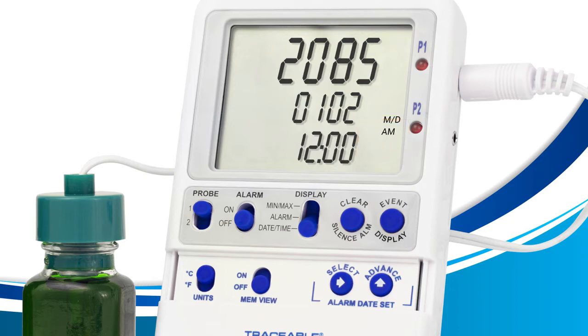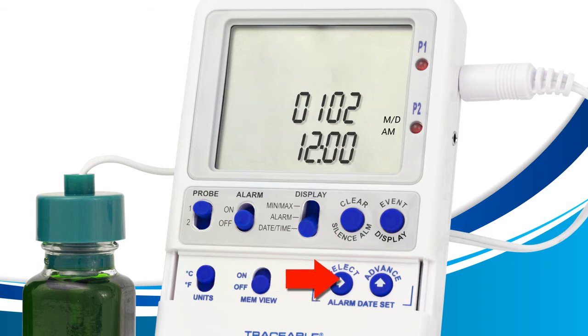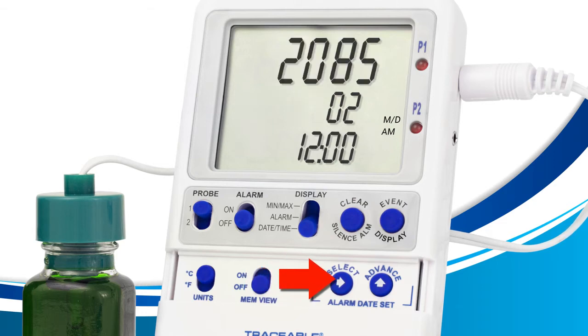To see this visually, let's practice using the Select button now. Grab your device and let's do this together. Start by pressing the Select button on your device. As you can see, the year begins to flash on the top row. This indicates that the year is currently selected. Press Select again, and the flashing area will move to the first field on the middle row.